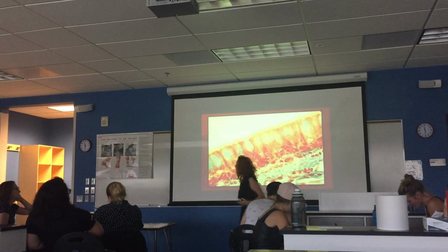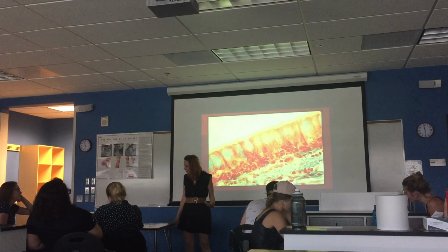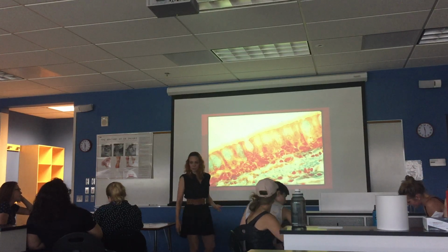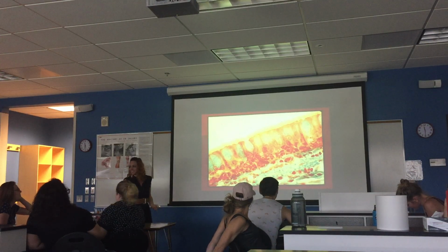This is the point where I say, isn't histology kind of pretty too? Like, don't you think some of these images are pretty? I mean, I guess it depends on the stain or whatever, but I think it starts to be beautiful. You can see art in here.